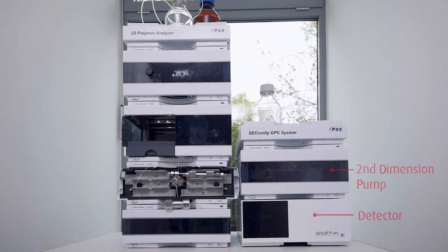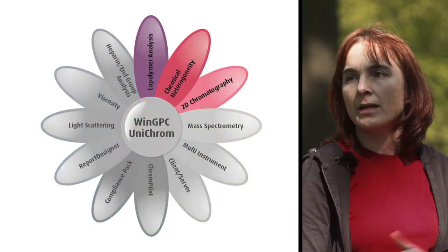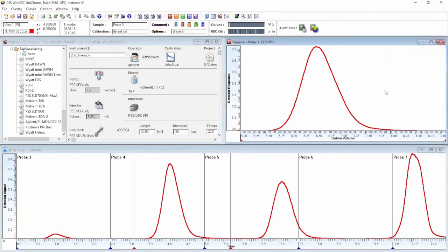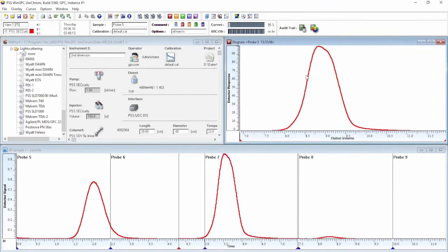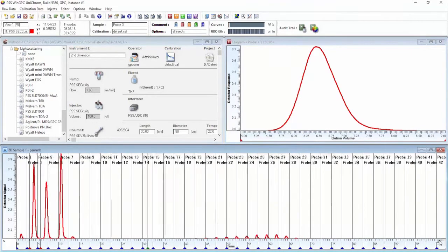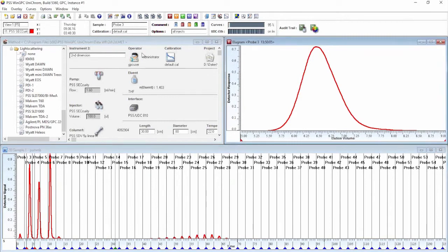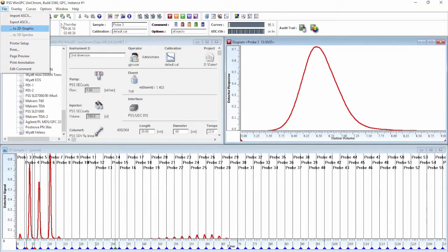We need at least one detector capable of detecting all the fractions, and then we need software which can record all those fractions and build a two-dimensional or even three-dimensional plot to analyze and visualize the results. Here we have the chromatograms obtained by the two-dimensional separation, and we can see how it would look if we did just the first dimension separation.